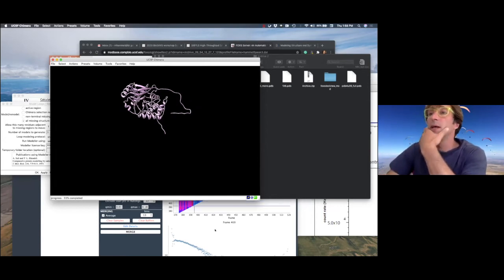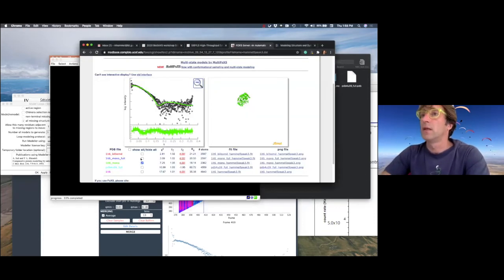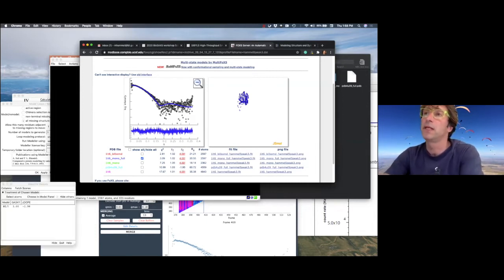And you look at that fit, how this full-sequence PDB fits the data, and obviously that's right here. It's improved from 7 to 3, but there is still something not right. And so you really want to be right, and you want to produce a nice fit to the data.